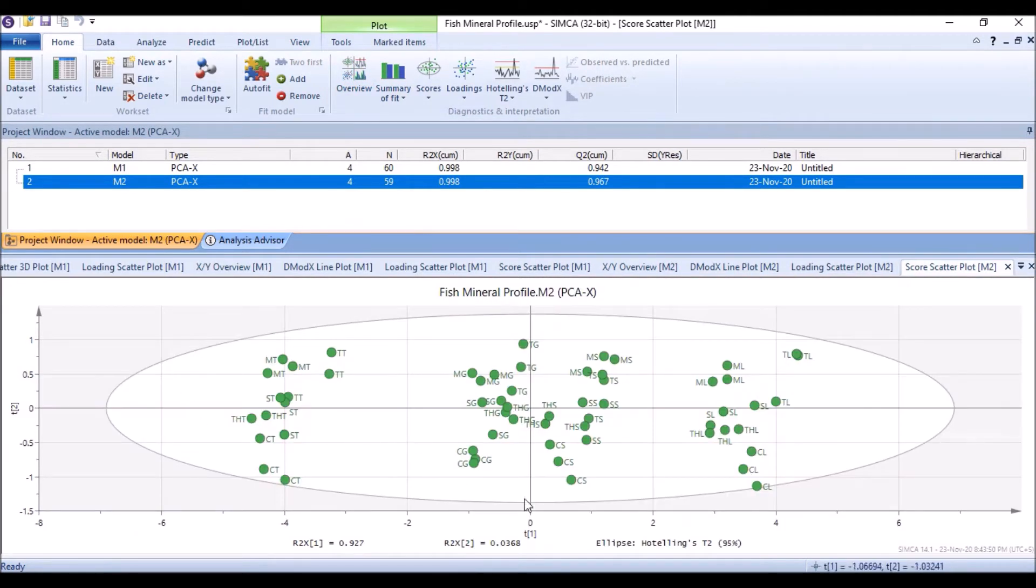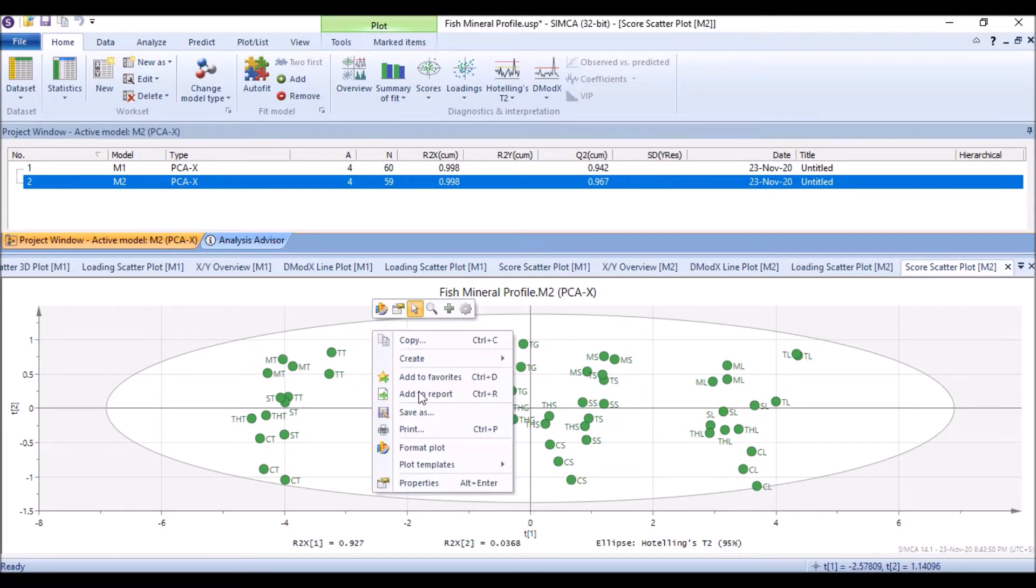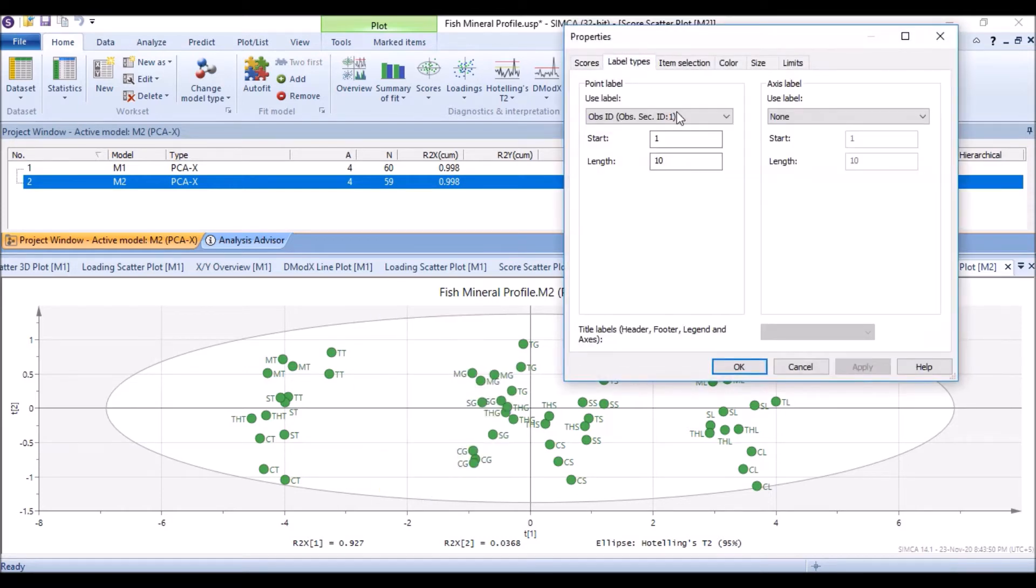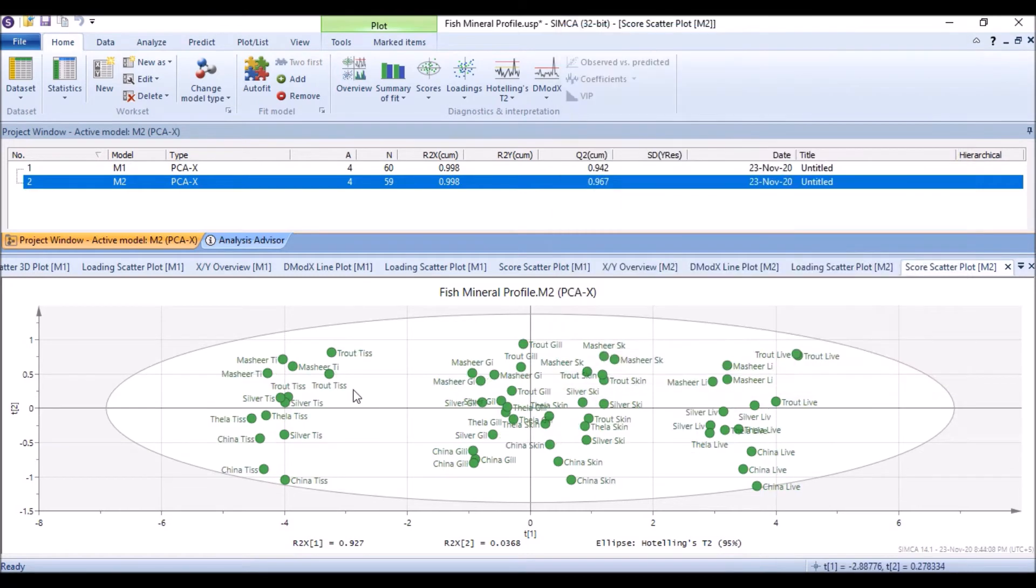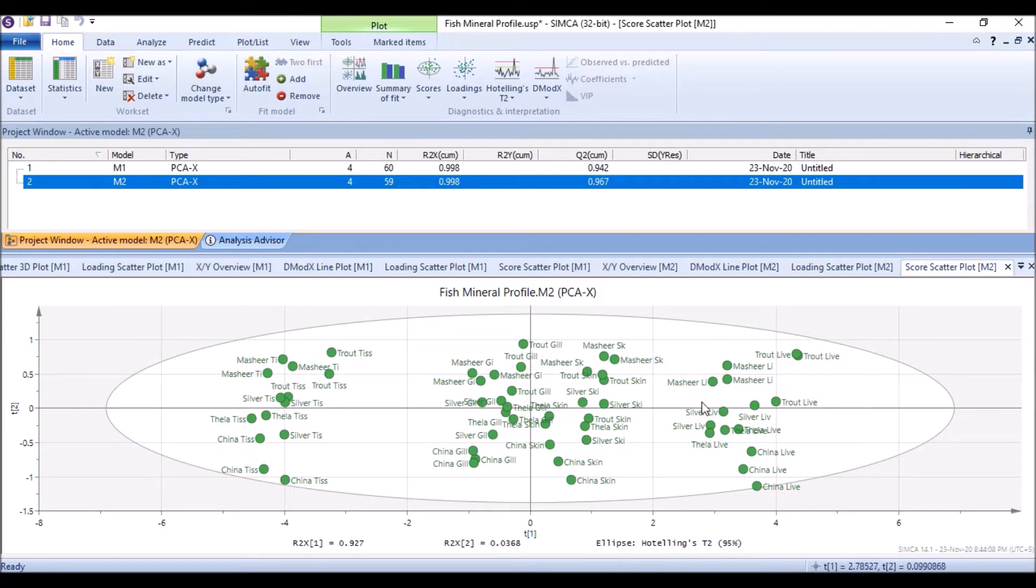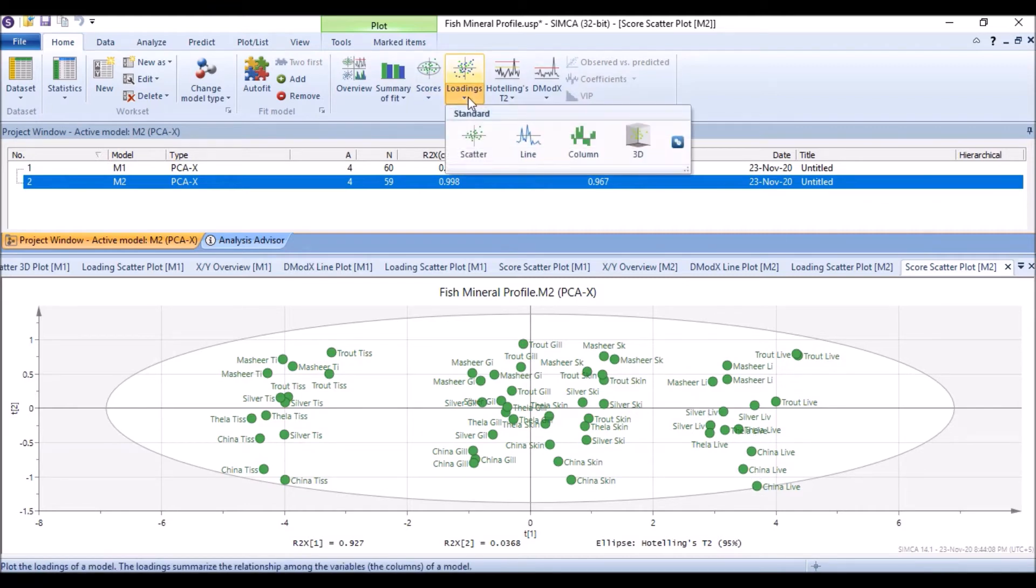When I get an overview of it, this is our score scatter plot when we remove the outlier, which is much better and much clearer. If I use the properties and the label and I mark it with the primary, now it's clear that this is trout tissue and silver tissue and China tissue, so all the tissues are here. Then the gills are here, then skin is here, and then this is liver for metal.